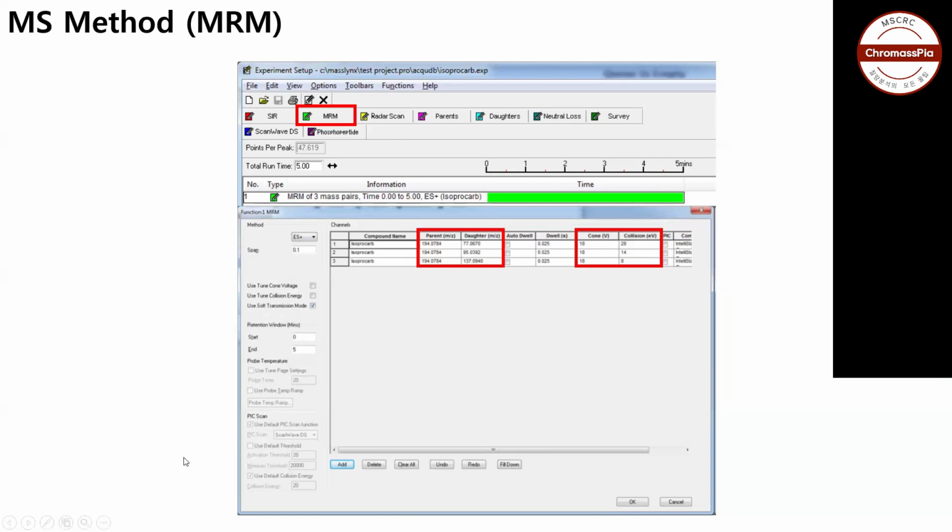So Ahmed, can you please tell us about this? Because last time you performed the experiment, and maybe you know how you selected those things, whether it was based on the intensity or some other parameter. Could you please repeat? I was busy with something else. What was the question? As you can see on the screen, isoprocarb. Okay. Sungjun, turn off your mic, please. He said that we can select PIC out of these three daughters. So I wanted to ask which one we will select.